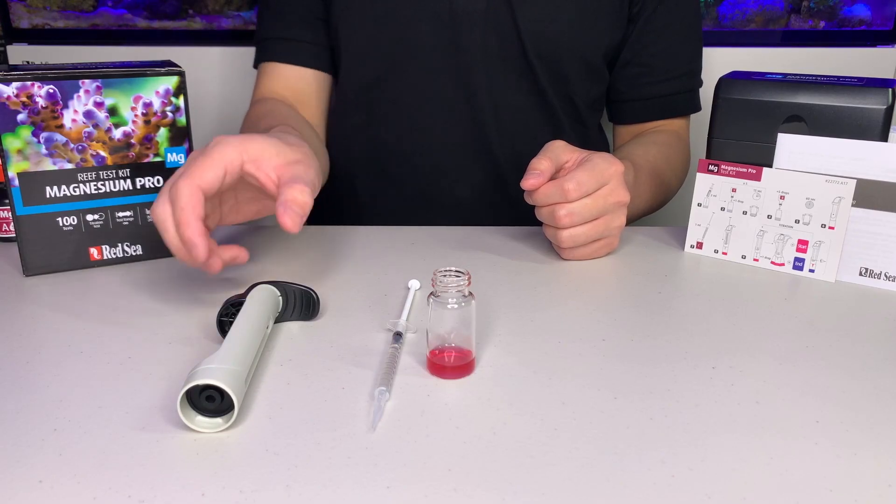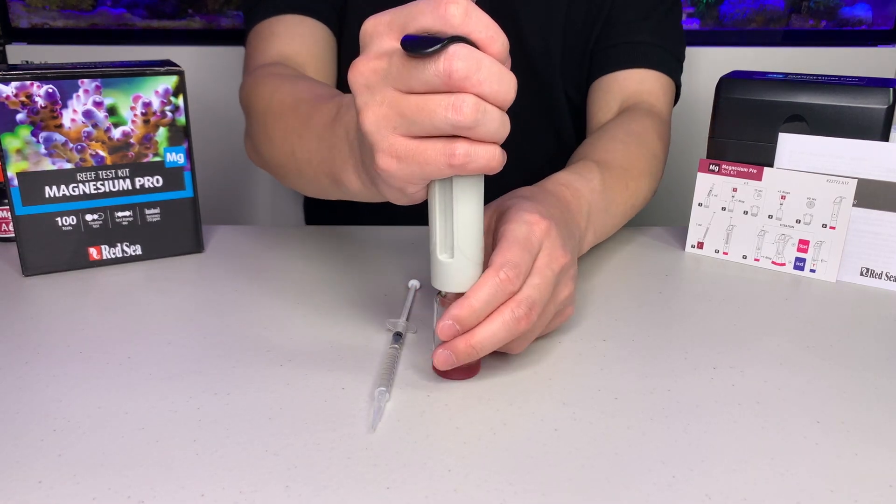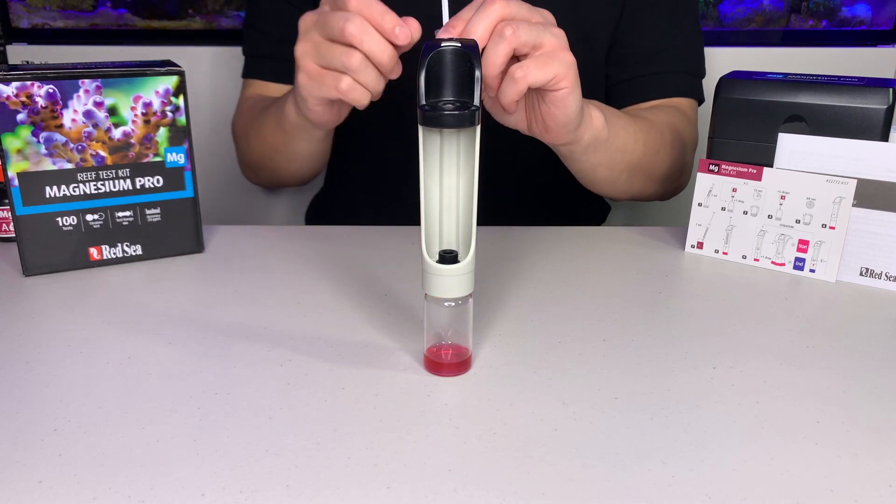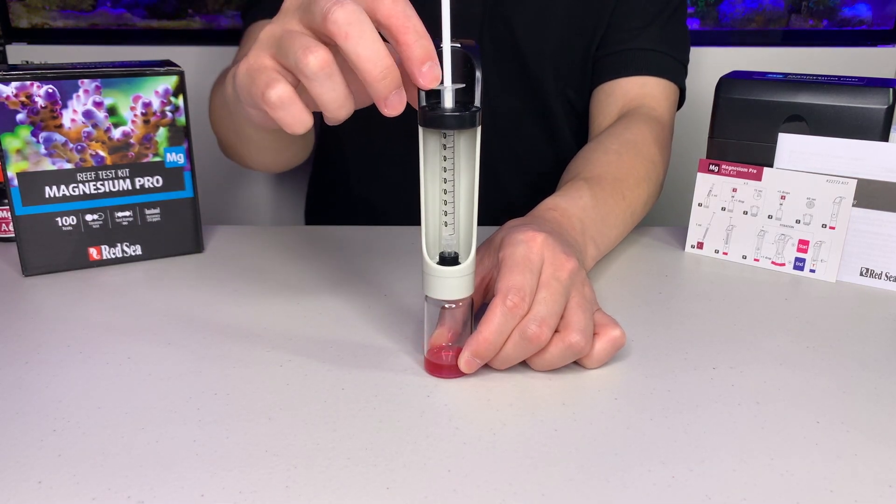Now we are going to assemble the titrator. Screw the vial onto the bottom, and we insert the syringe into the titrator. Make sure the scale is clearly visible.